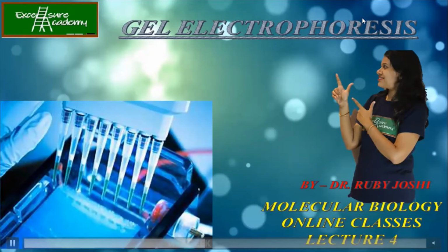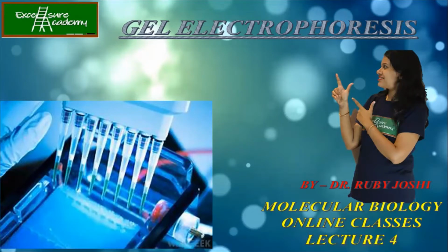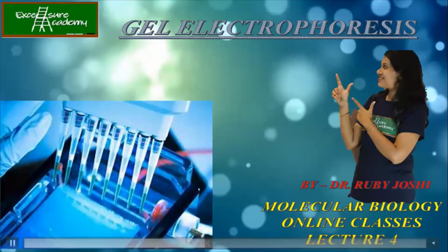So today we'll be doing gel electrophoresis. This is again part of your methods in biology. Before, we discussed how DNA and RNA are purified. Similarly for protein, we'll also study the purification methods, starting from lysate preparation, and then the chromatographic columns. The columns will take time to study in detail, and then we'll study how exactly the proteins will be visualized. So we'll go accordingly.